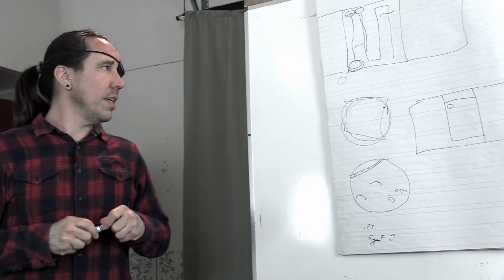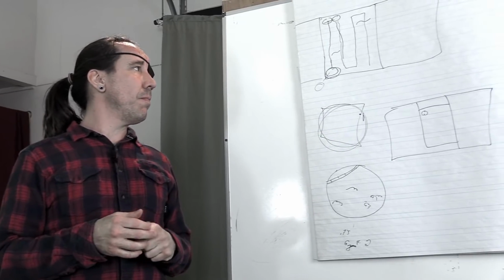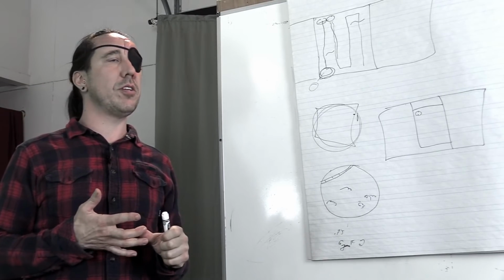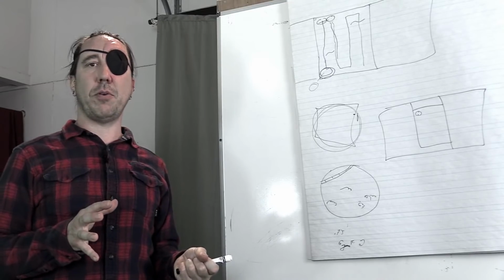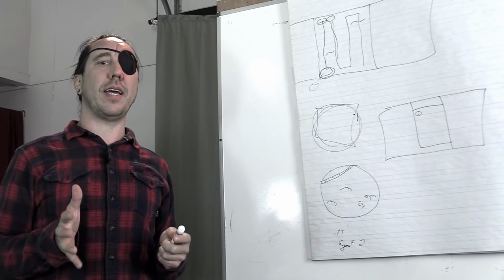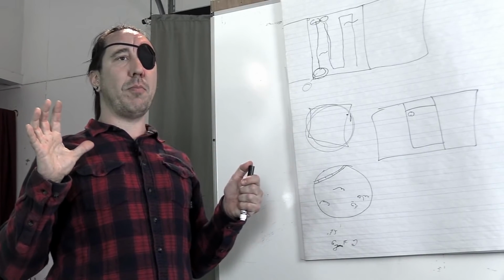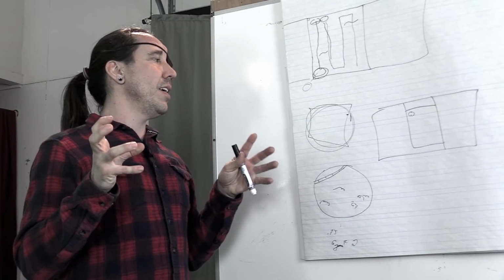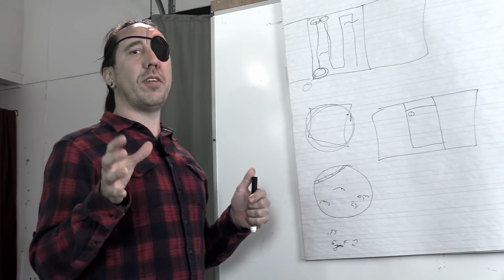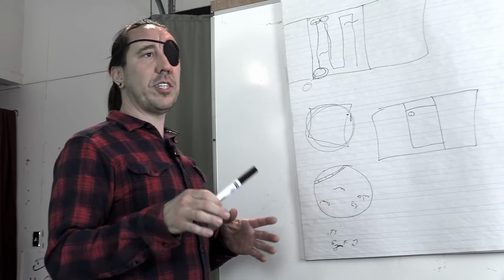All right, I think that we should be good for this. So again, we're looking for bacteria, fungi, protozoa, and nematodes. When we're going through a sample, we're looking for movement and shapes. A lot of people get bogged down by, what's this, what's this, what's this? Really, I'm just trying to focus on the organisms that I'm looking for. There are going to be other things in there that I want to keep an eye on, but generally I'm just looking for shapes and movement.